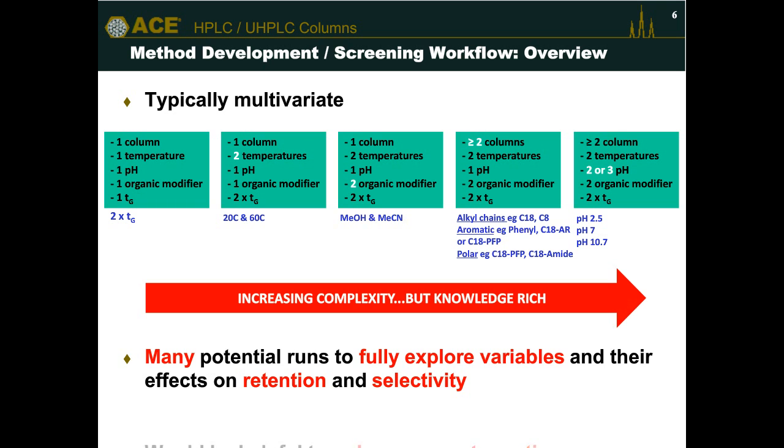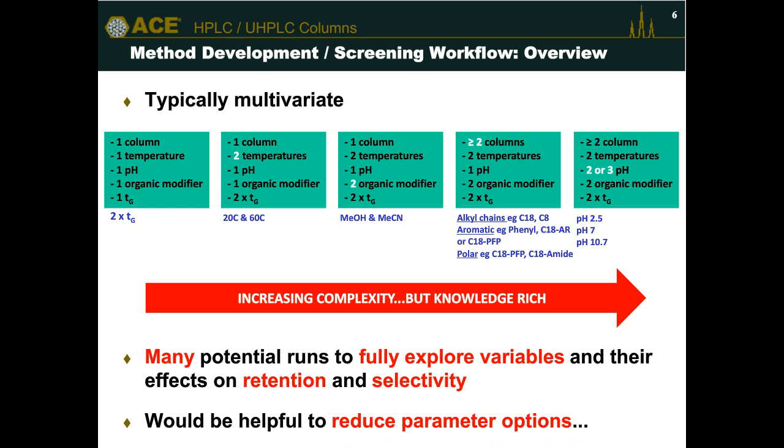Now, of course, what would be helpful, and if we consider selectivity, we can do this, is if we reduce the number of parameters that we explore during our method development, if we think about those parameters that have a big impact on selectivity.